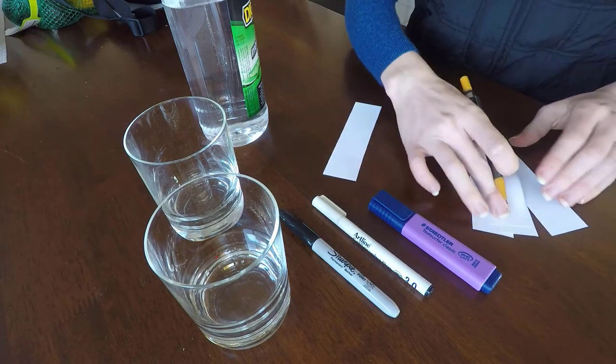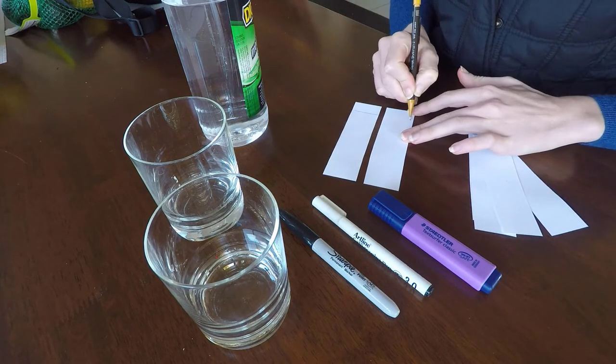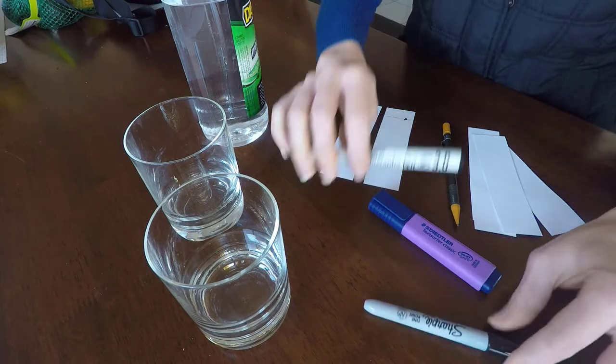The first thing I did to get started was to draw a line on the paper with the pencil. Graphite isn't soluble in ethanol or water, so it's a marker of where our experiment begins.